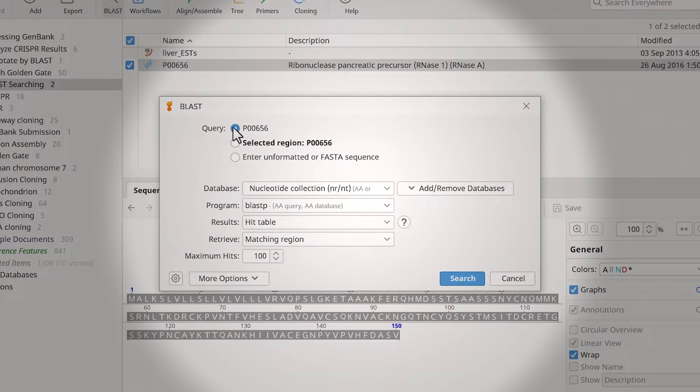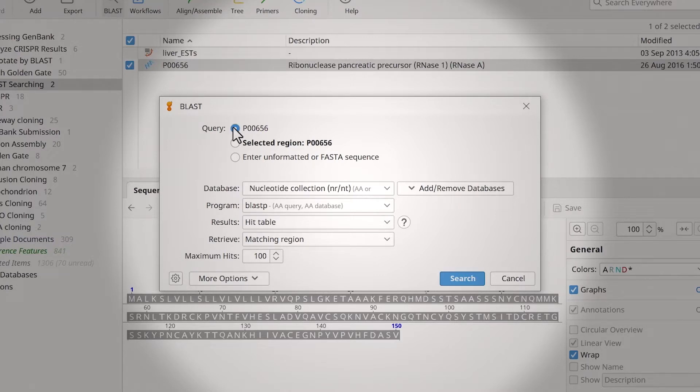Genius automatically determines the appropriate settings for the chosen sequence type. The default database is nucleotide collection, used for protein and nucleotide sequences.